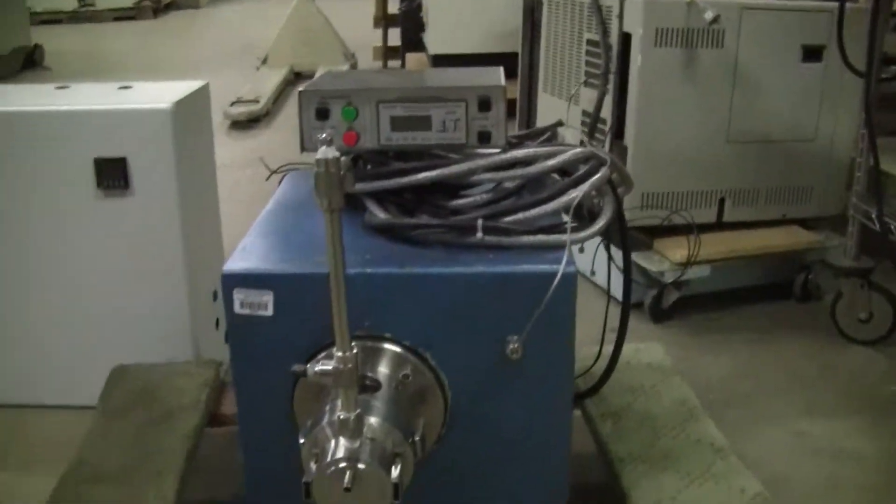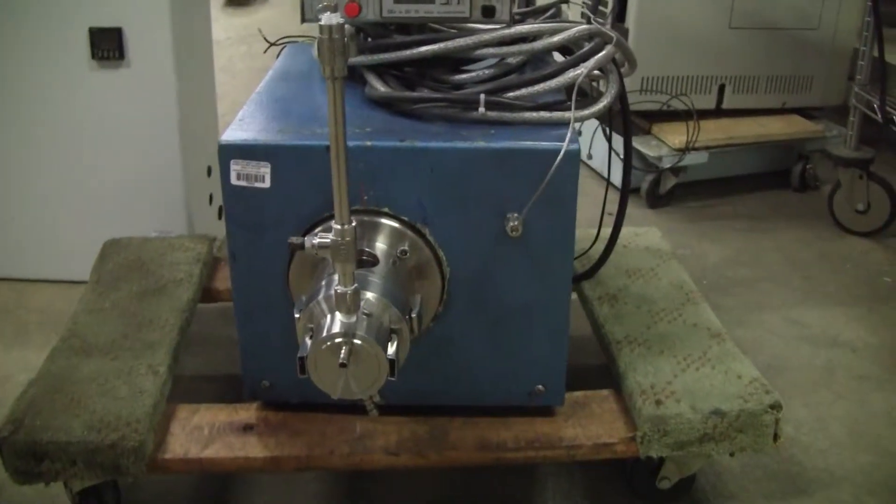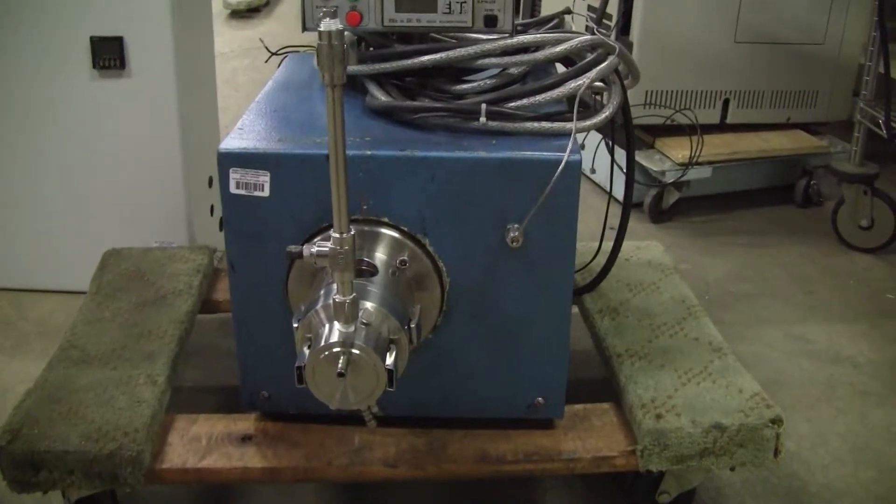Hi, this is Jim from HitechTrader. Today we're looking at an Iger Mini Mill, model M100VSE.